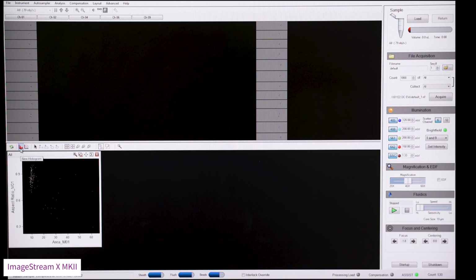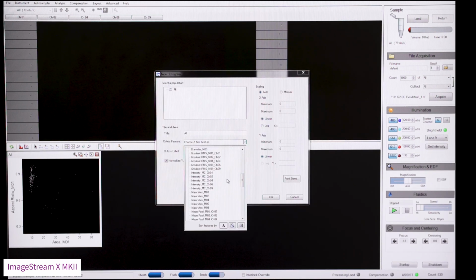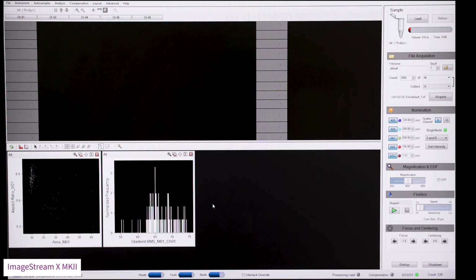You can then press the new histogram and select Gradient RMS for channel 1 as the X-axis feature. This plot assesses the quality of bright field image and allows us to select the in-focus events. You can then set up any plots relating to your samples.